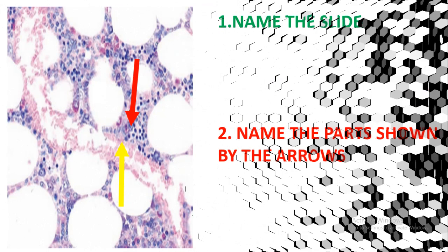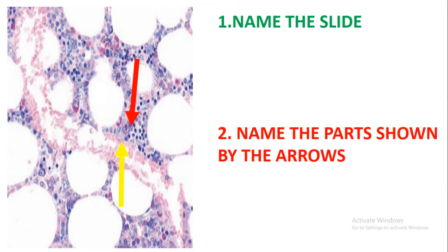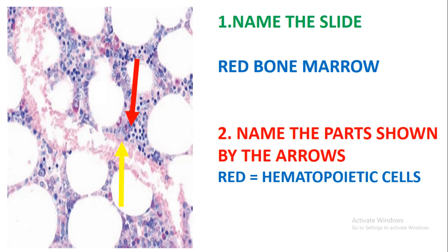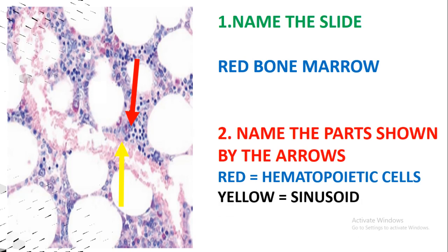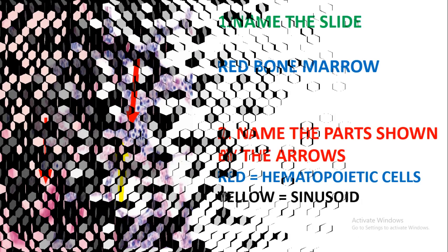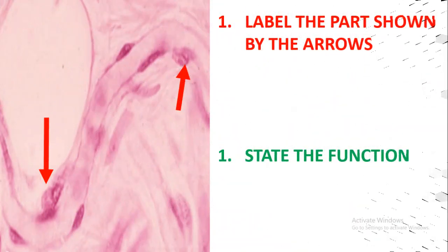In the next slide we have been asked to name this slide. If you look at this slide, it is just the red bone marrow. Name the parts shown by the arrows: the red arrow is showing the hemopoietic cells and the yellow arrow is showing the sinusoid.